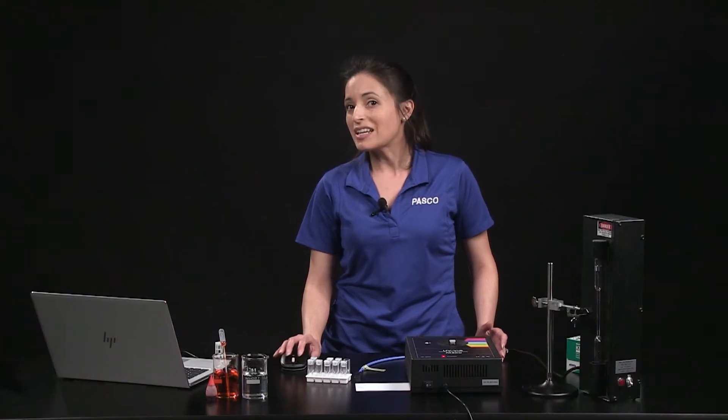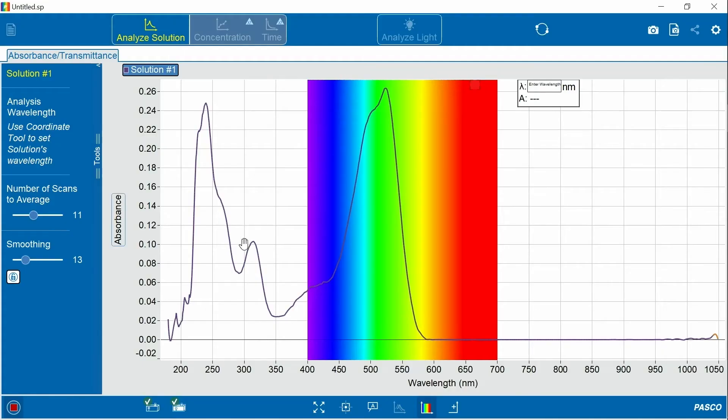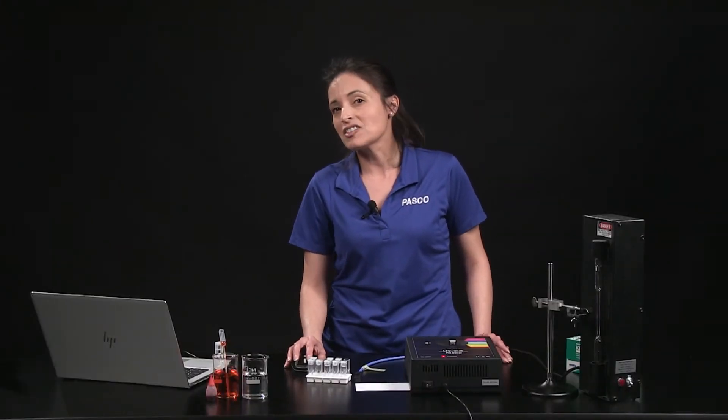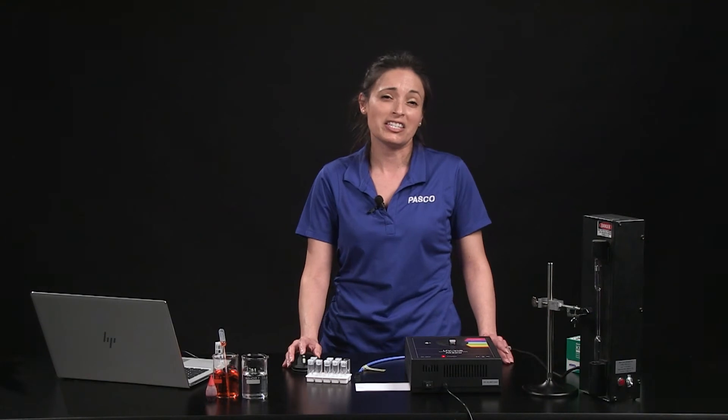This allows mostly red and other wavelengths to be transmitted through the solution to our eyes. You can also see that the spectrometer detects some light absorbed by the solution here in the UV region. Our eyes can't see this. The UV region appears here because this molecule in the red food coloring contains a highly conjugated organic molecule with many adjacent double bonds.